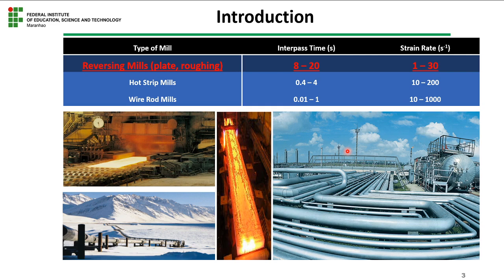This material was normalized as API grade X52, microalloyed with vanadium. Today, due to the excellent properties achieved so far, the X70 and X80 grades are still the reference materials of today.